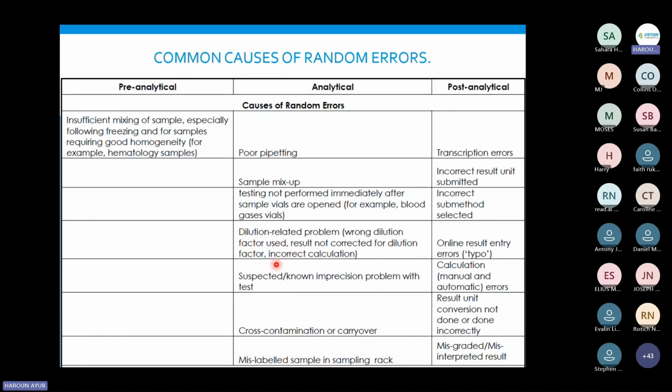Your QA or your lab manager should be able to put that as a policy in the lab, that you need to use the correct pipettes. You need to be sure of this volume. Is it 1 ml? Remember, 5 ml. If I reconstitute my EQA with 5 ml, and another person reconstitutes using 4.5 ml, and another one using 5.5 ml, or even 5.01 or 5.02, these varied results will give you wrong results. So use a pipette, forget about syringes when you come to the laboratory, and it should be a calibrated pipette.